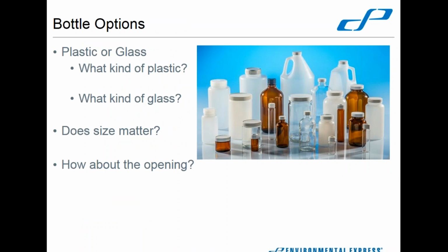How you collect your samples, or what you collect your samples in. Generally speaking, you're going to be using plastic or glass. A lot of the information I'm giving you here is coming out of the most recent 40 CFR Part 136. I think it's in Table 2, the required containers, preservation techniques, and holding times.